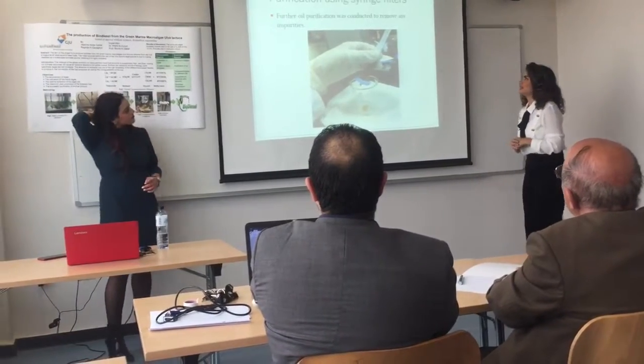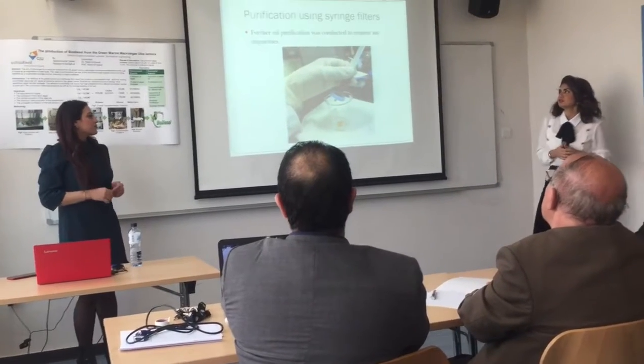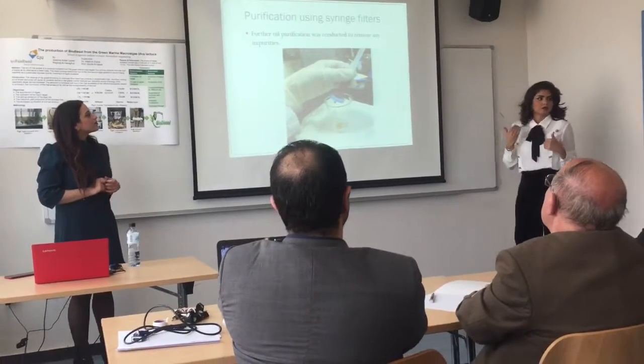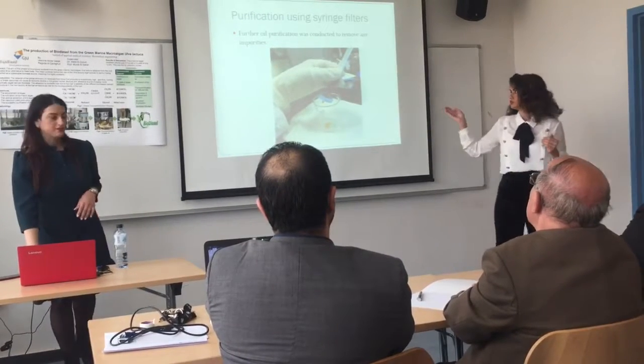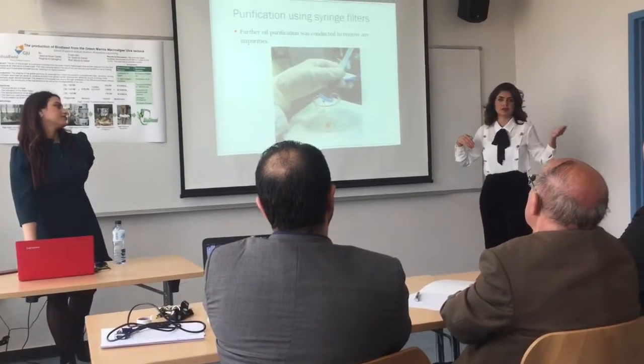For further purification, we used syringe filters to remove any impurities from the biodiesel, from the oil, sorry. And we can also use this procedure later on for the biodiesel.